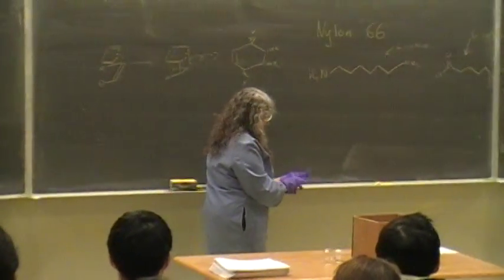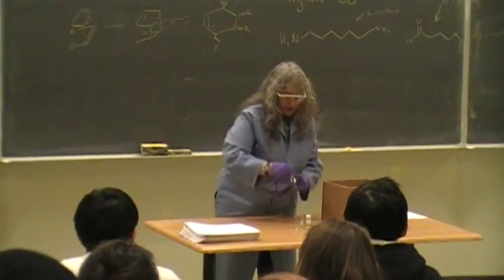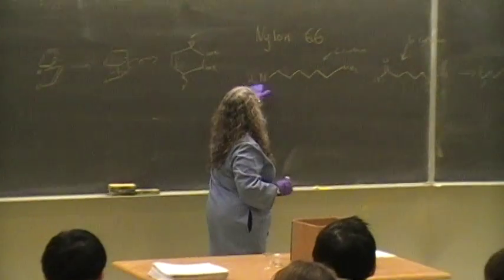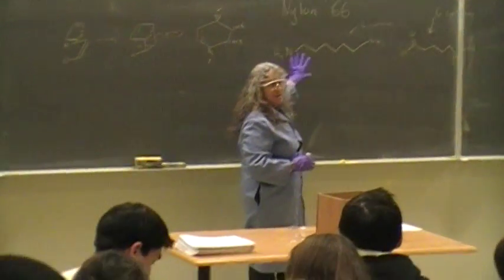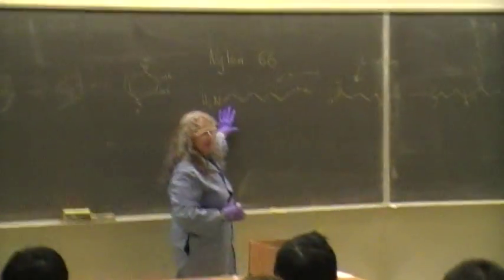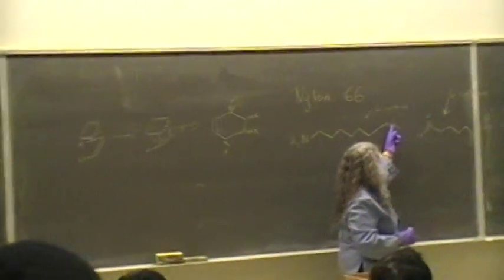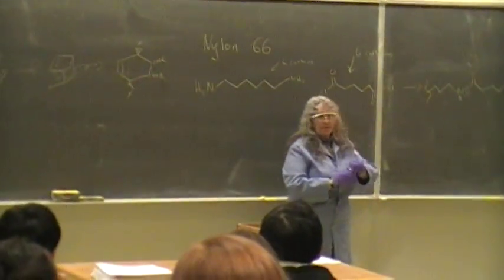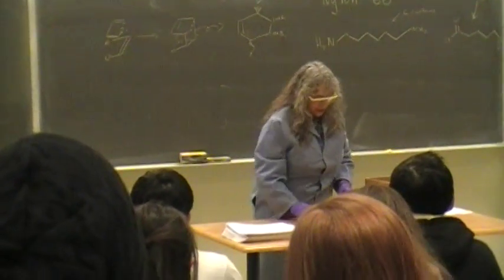So we've got, in this kind of yellowy-colored aqueous solution, this is the amine in about half molar sodium hydroxide, so it's an aqueous solution with a little bit of base. We're going to be generating HCl from one of these hydrogens and that chlorine, and one of these hydrogens and this chlorine. So we've got base in here to soak that up and to make the reaction go a little faster.